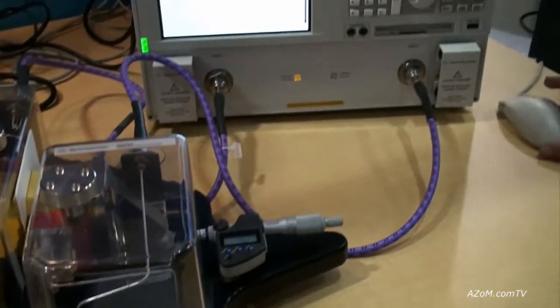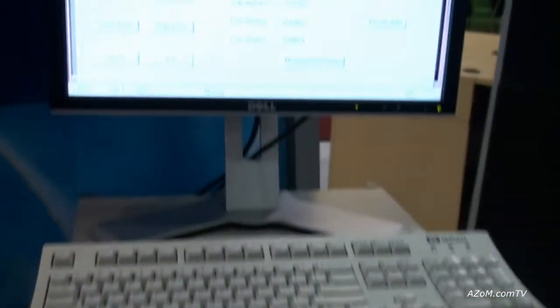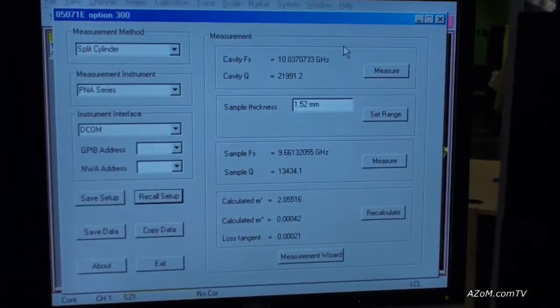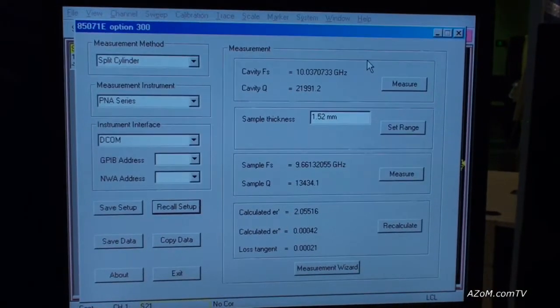So if we look at the software, this is a look at our software. It sets up the measurement and does all the calculations.